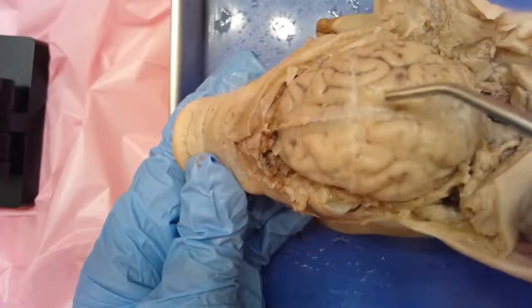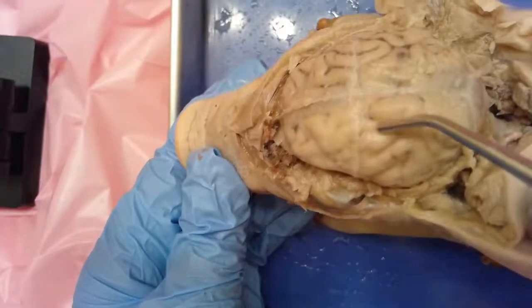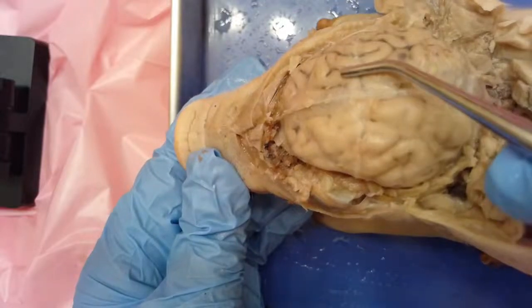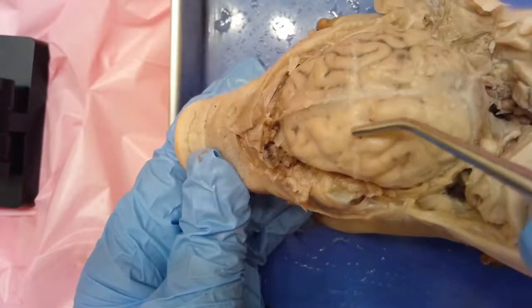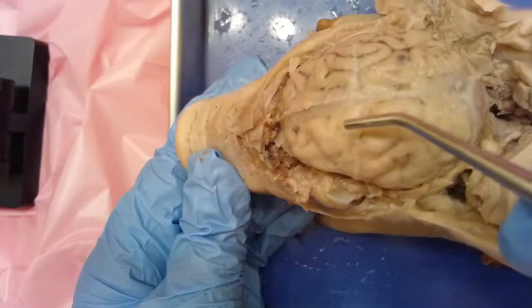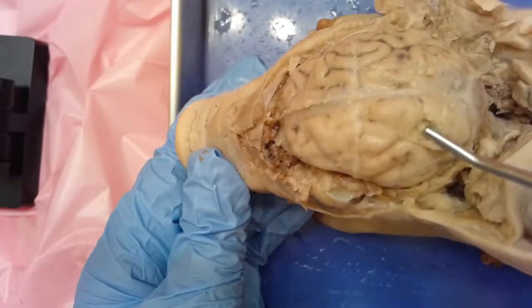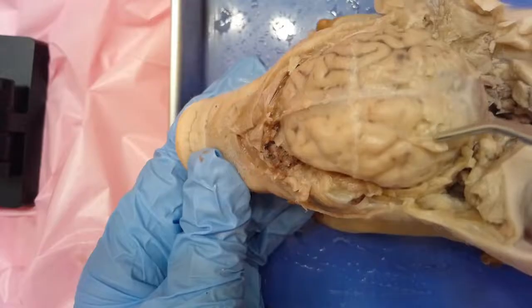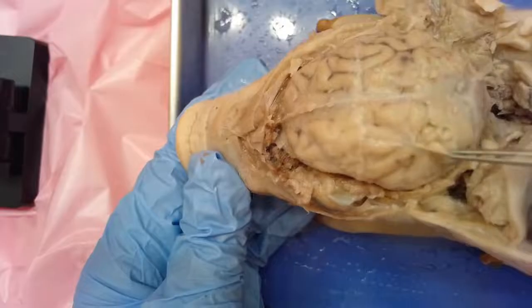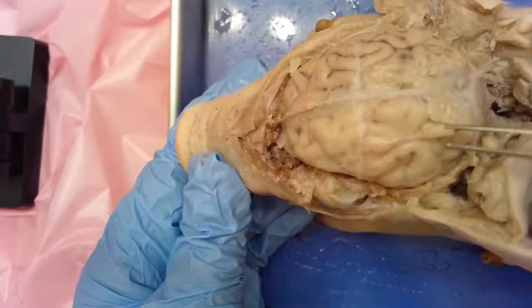You'll notice there's a kind of milky white appearance. There's actually a tough outer coating called the dura mater, and it is another protective layer besides the skull for the brain. It is what's helping everything stay intact. If I were to break through that membrane, it would be all mush underneath. I can kind of lift it up and show you — this is that dura mater, that outer covering, and you can see how soft the brain tissue is just underneath.